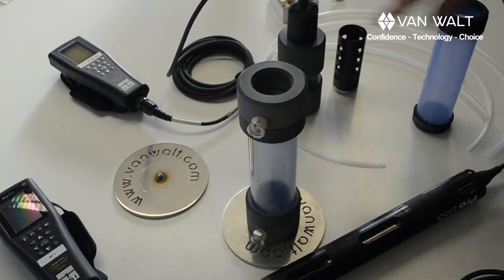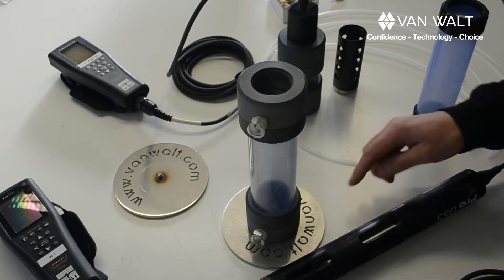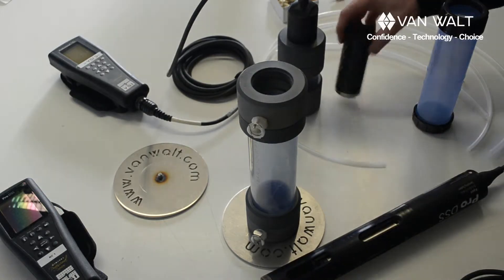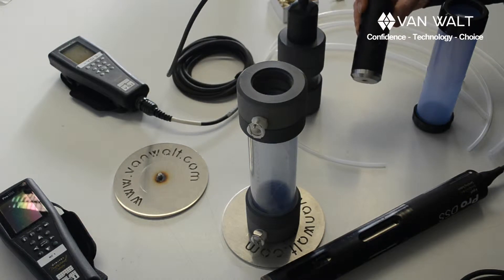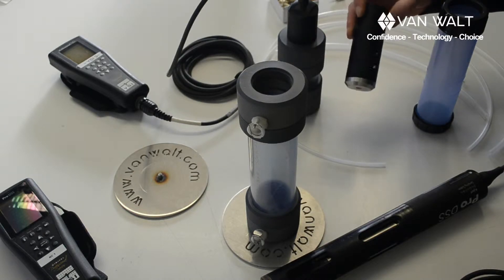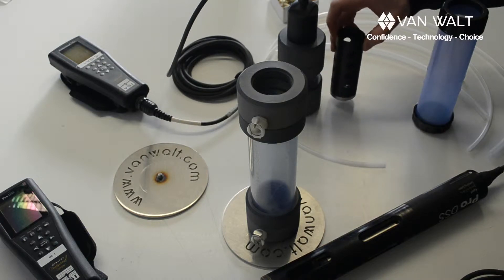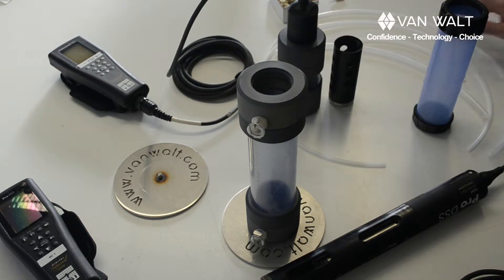These water quality meters as standard come with a cage. This one's attached and this is the one that comes with the Probe Plus. If you're not going to use a flow cell then you would do well to use these cages to protect the probes. Typically you do that if you were measuring in a stream or perhaps in a bucket if you were low flow sampling.